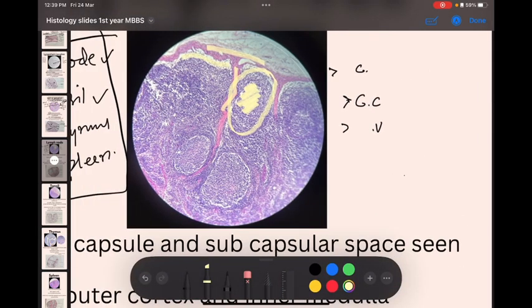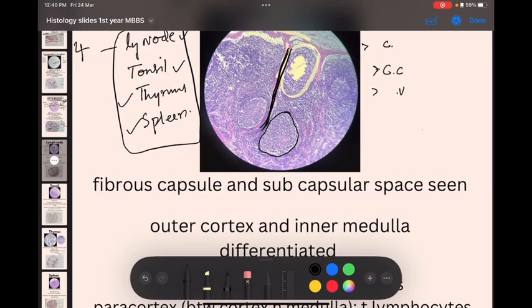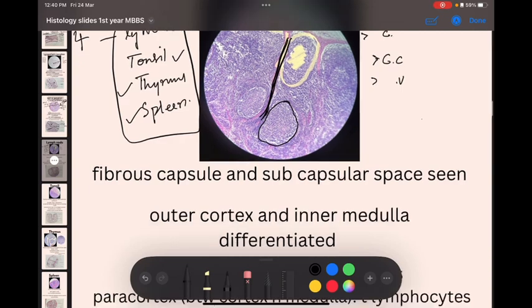If you observe, the key identification point for the lymph node is that we have trabeculae and lymphoid follicles. That's all. It is pretty easy, but most people get confused while identifying in the practicals. Don't get confused. Go to your lab, see the slides again and again, see this video.